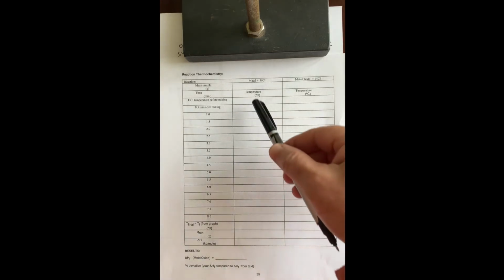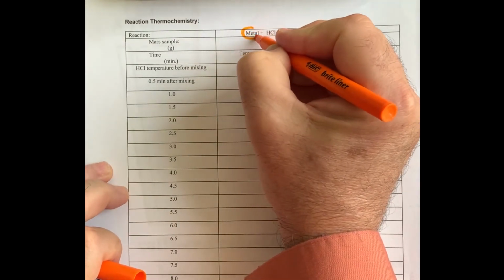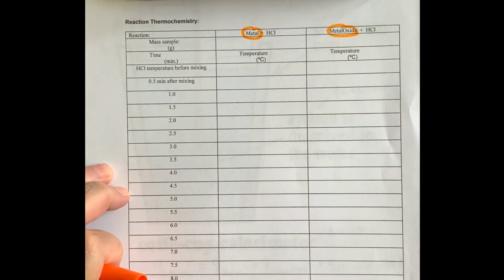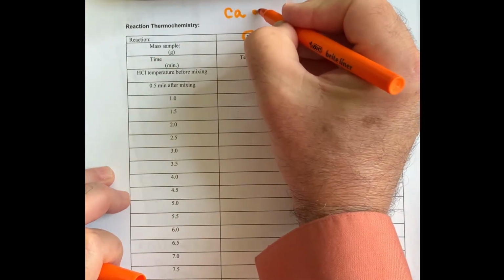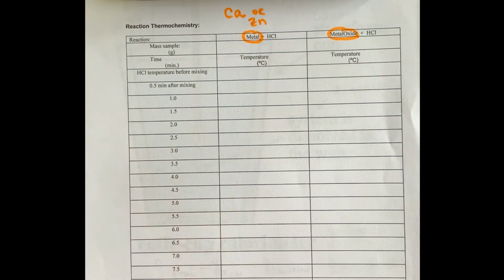And you'll be provided with a set of data for a metal or a metal oxide, right? And please pay attention to what metal or what metal oxide you have. In the online simulation that we're doing, some of you may receive calcium, some of you may receive data for zinc, and of course the corresponding oxides. So make sure that you write down on your data that you copy which one it is, and also on your graphs that you're going to be drawing.